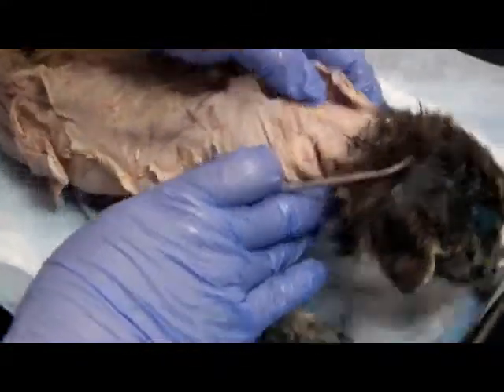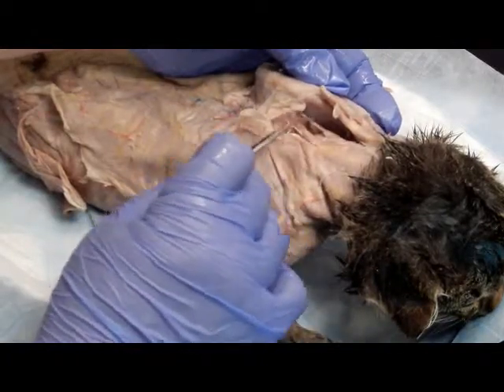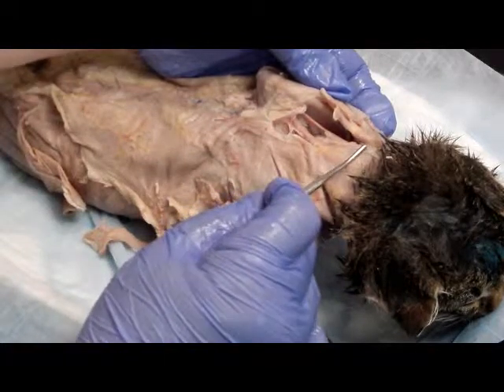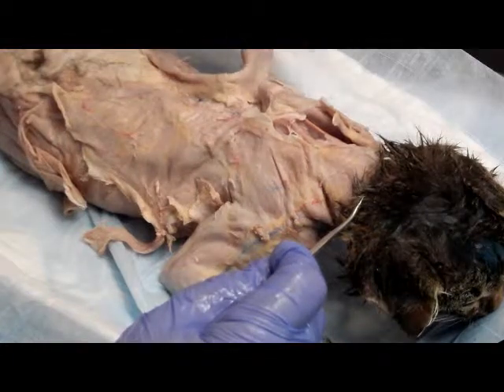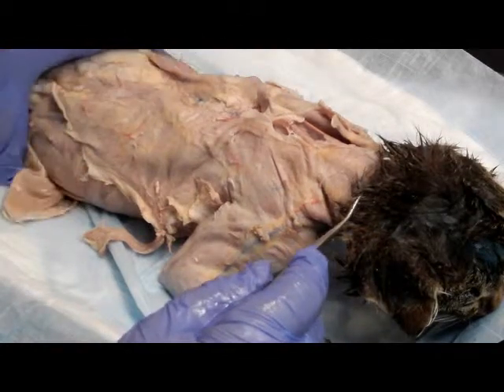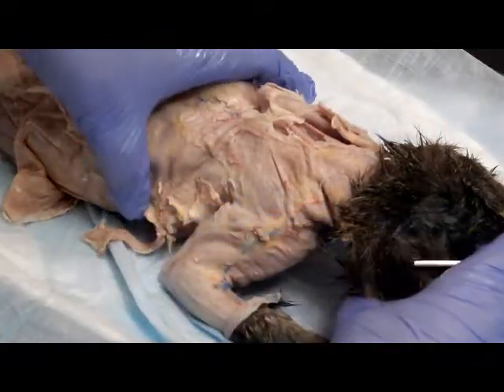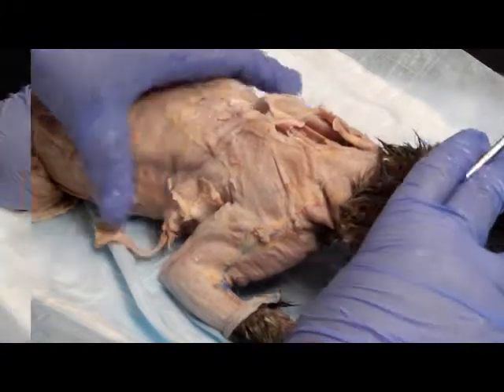The levator scapulae. Its origin is the transverse process of the atlas and the occipital bone. Its insertion is the metacromion process and neighboring fascia, and it draws the scapula craniad, anterior in animals and superior in humans, so it draws it up.